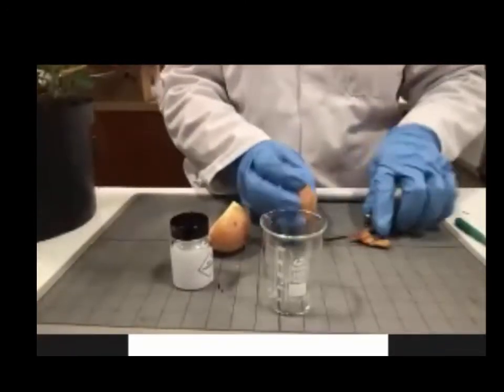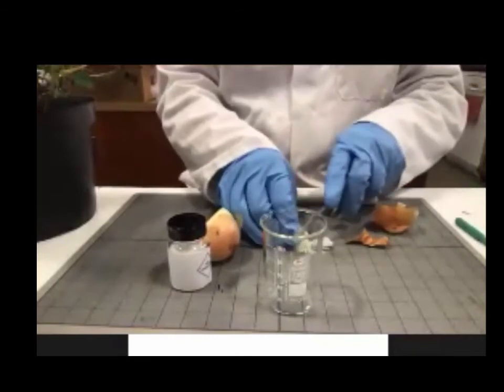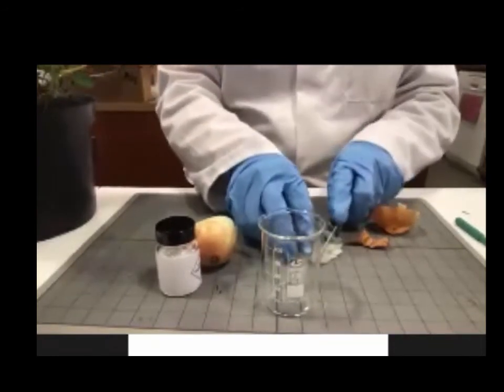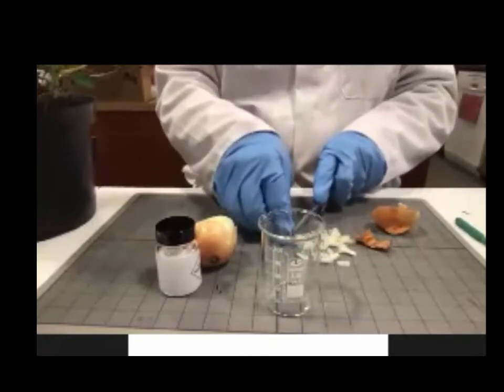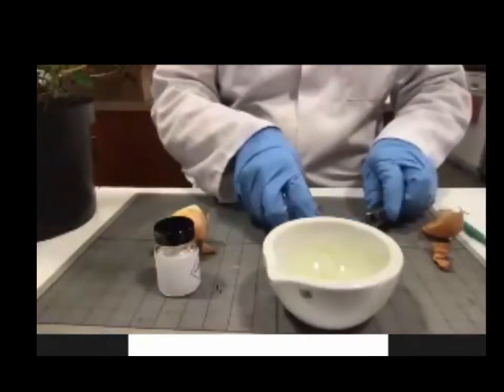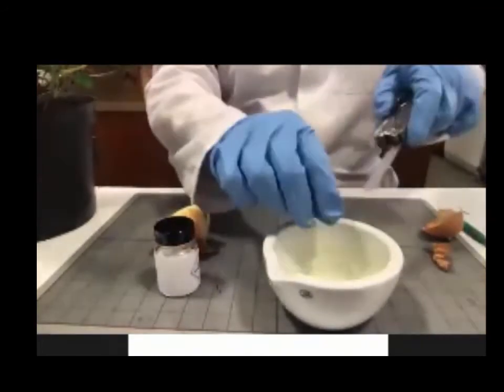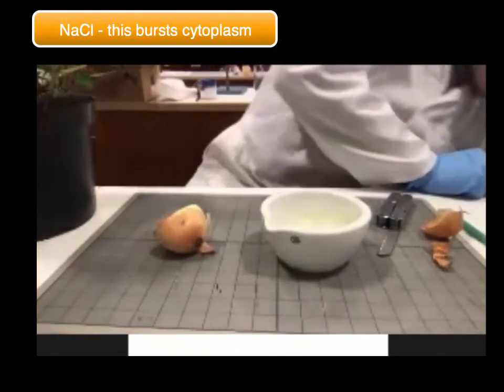Okay, so we'll just... butter. Okay, so we cut an onion up. It doesn't have to be the whole onion. Now we could use a food blender, but hang on, I'm going to use the mortar and pestle again. Okay, and I'm just going to add a little bit of salt. Yep, sodium chloride.